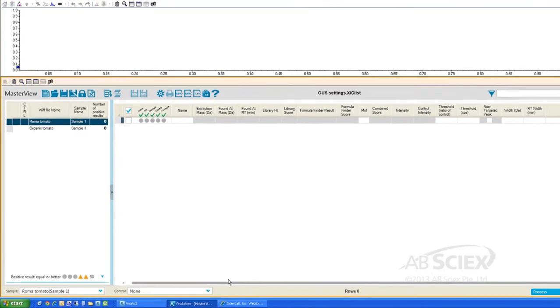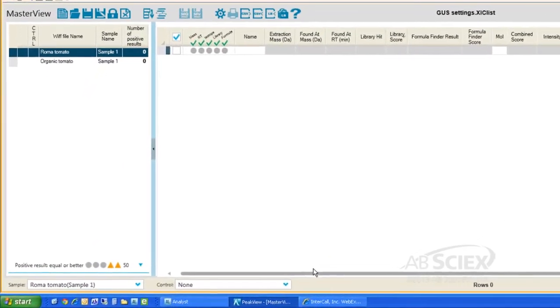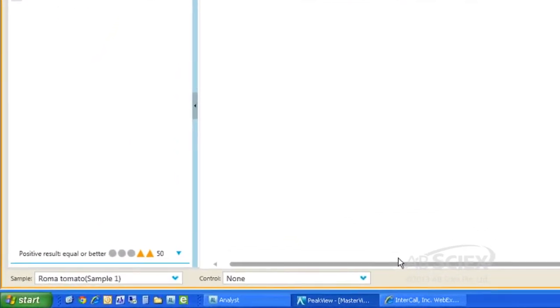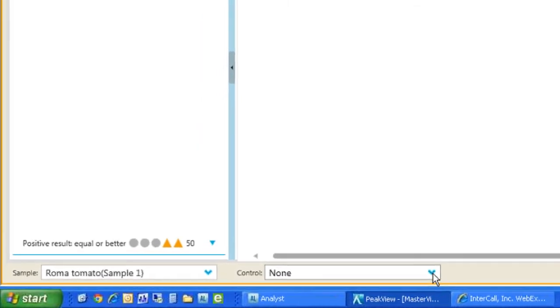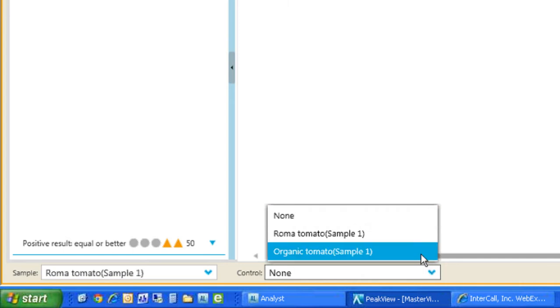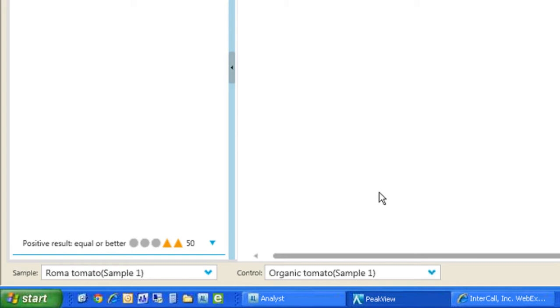When performing a non-targeted analysis, comparing our unknown sample to a control sample allows us to quickly survey and remove any chemical compounds that are identical between the two samples to allow us to more efficiently highlight features that are different. This comparison allows us to only focus on the suspicious peaks in the sample and ignore the normal chemical characteristics of the tomato, such as sugars, nutrients, or other healthy chemicals present in tomatoes.